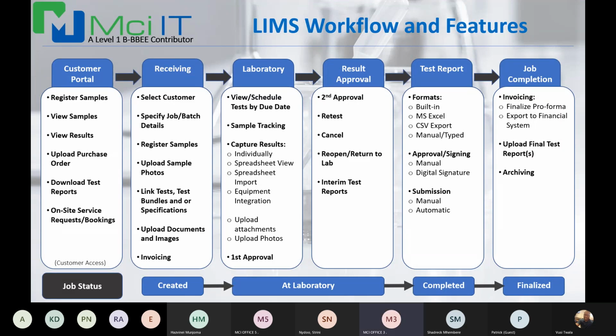What I can perhaps also elaborate on is that more and more laboratories are starting to look into equipment integration. Different equipment operates on different protocols. We can integrate equipment or automate the data flow, which I think is the larger objective, to many different instruments. A lot of laboratories use scales or balances. For that, we have a middleman interface that transmits the measurement directly from the instrument to the system without any data files in between.